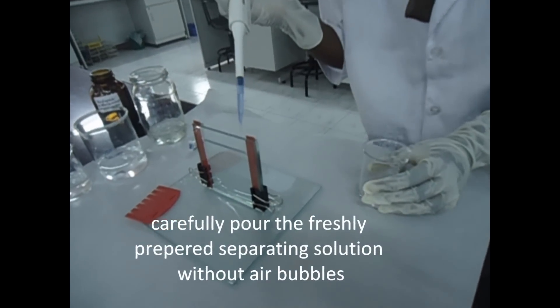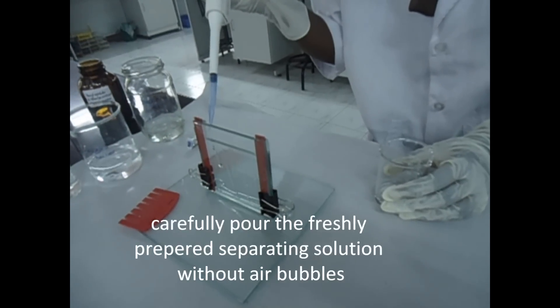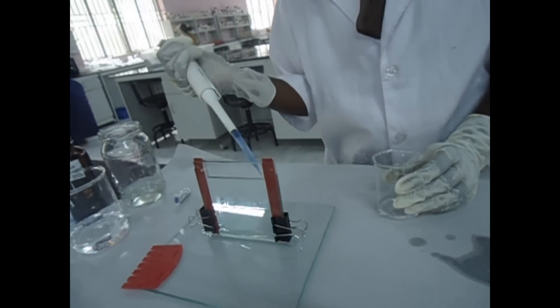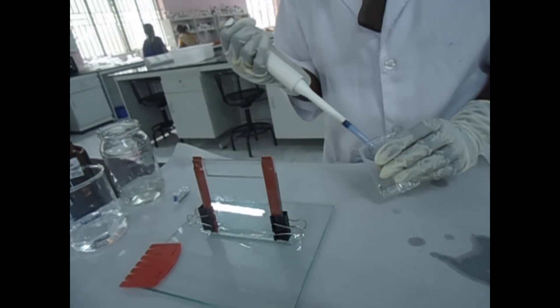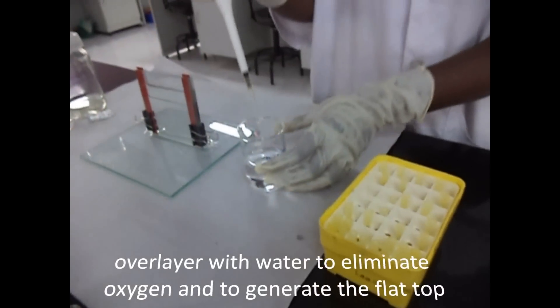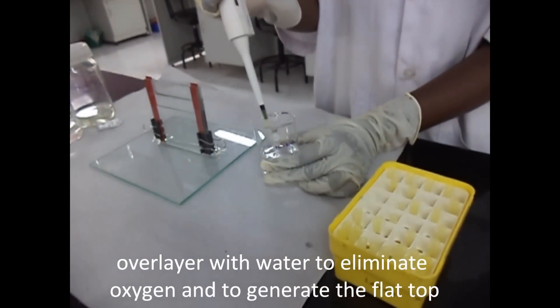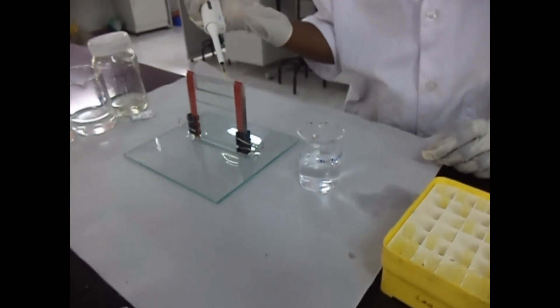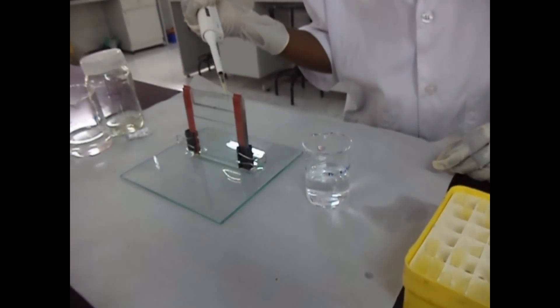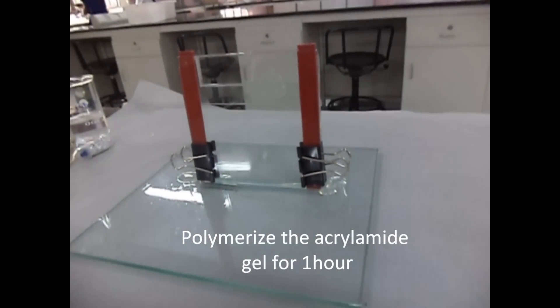Carefully pour the freshly prepared separating gel without air bubbles. Overlay with water to eliminate oxygen and to generate a flat top. Polymerize the acrylamide gel for 1 hour at room temperature.